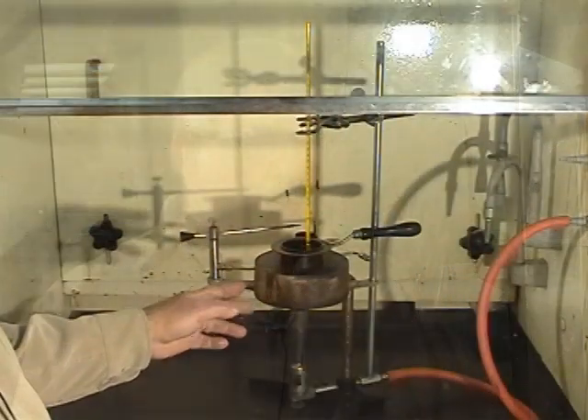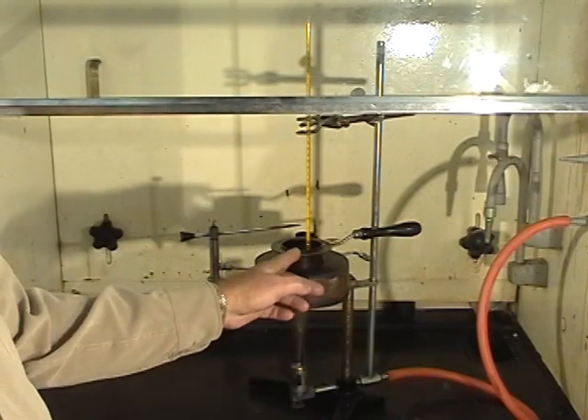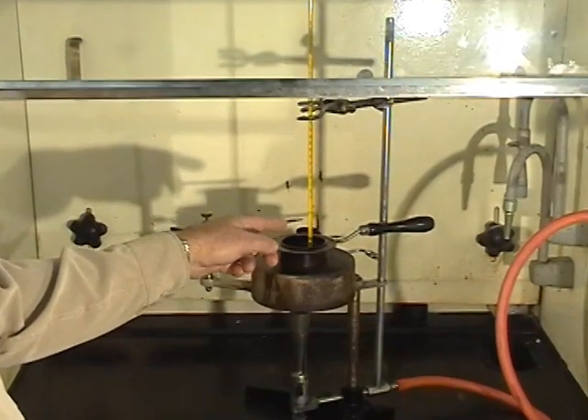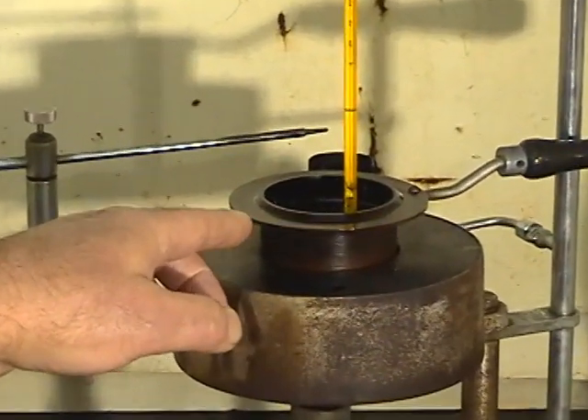We've got our flashpoint apparatus here, which has a Bunsen burner underneath it. We have a little pan of oil with a thermometer in Fahrenheit, immersed in the oil but not touching the bottom or the sides.